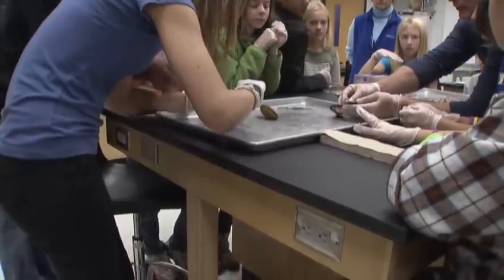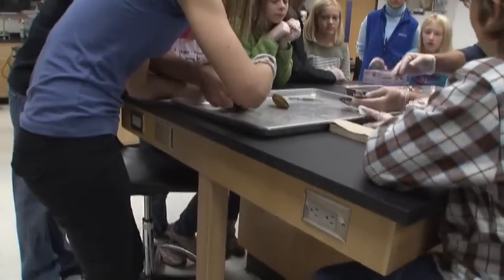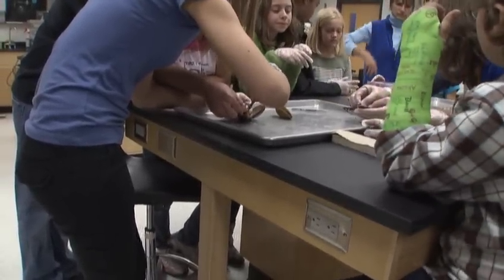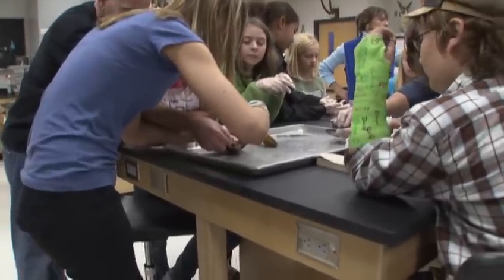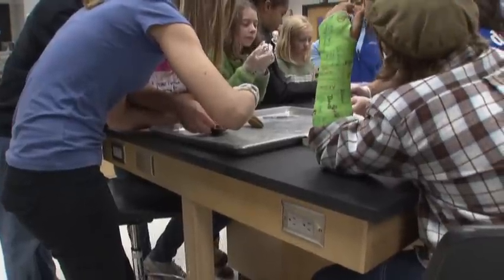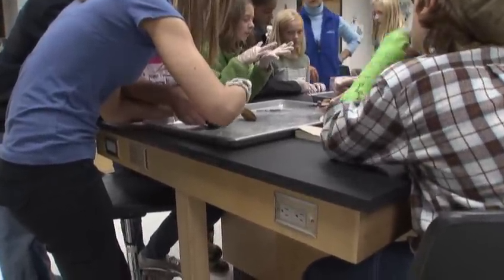Look, I'm squeezing water out of the mouth there. Ooh. See? Well, you can't see the mouth very well. It's very hidden. The mouth is right there. And it's got these little palps here that help push the food from these gills up into the mouth. So it's a really simple system. Filter feeders don't need a brain, really, do they? Do they really need a head? They probably honestly don't need that.